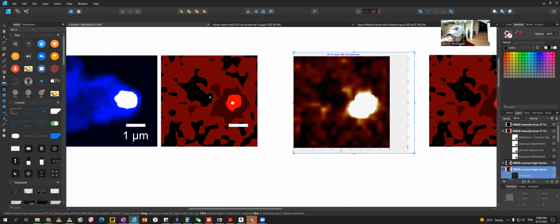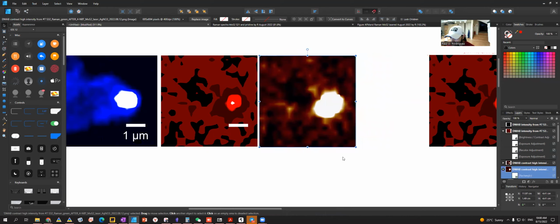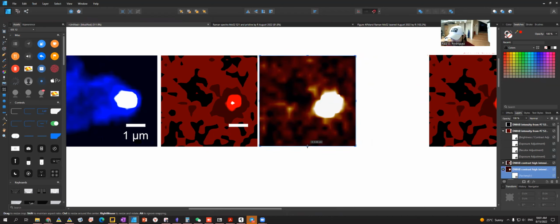No, I cannot do this now. Let's see. Can I do this one? Yes. As you see, this is not going to be so precise if you don't use the figure guides here. And they don't have exactly the same cropping.